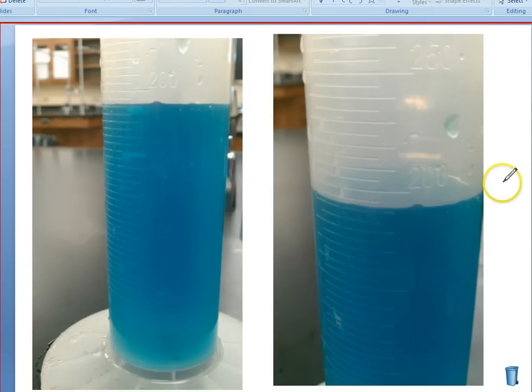Let's look at one more graduated cylinder. Here we're measuring by 50s. We've got 50, 100, 150, and then 200 up here. Let's look at our lines to figure out what each little bitty line represents.